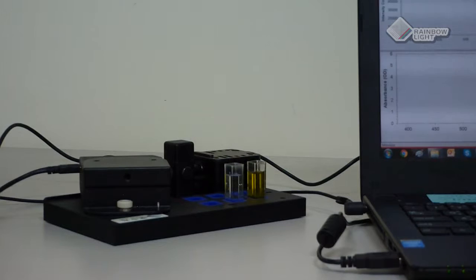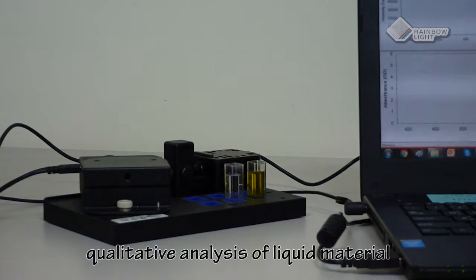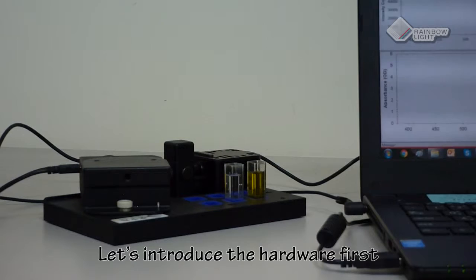Now we are going to introduce the Rainbow Light Absorbance Tester. This is our absorbance tester. Today we are going to introduce its hardware and its software. Usually this is for doing quantitative and qualitative analysis of liquid material.